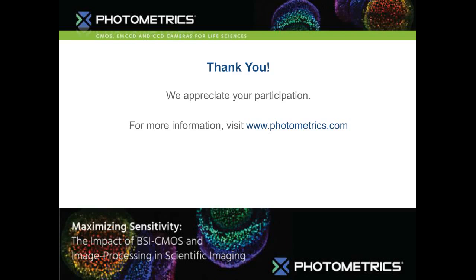How does the BSI compare to the sensitivity of an EMCCD when the BSI is binned 2x? So this was one of the questions that I had a feeling would come up. Because they're both backside illuminated pixels with the 100% fill factor, it would compare very, very similarly.